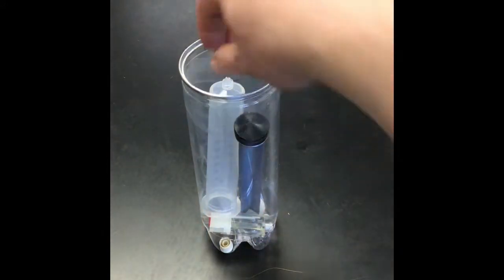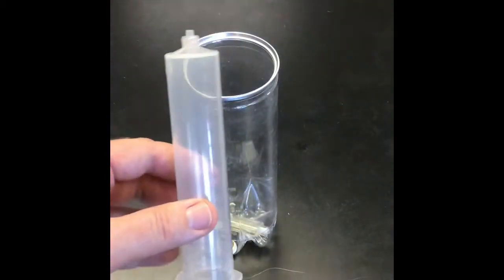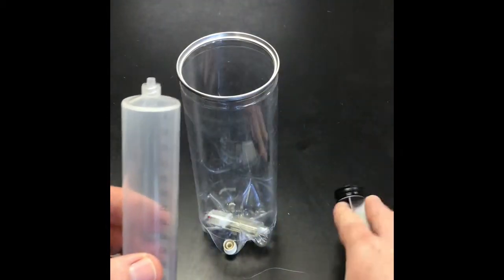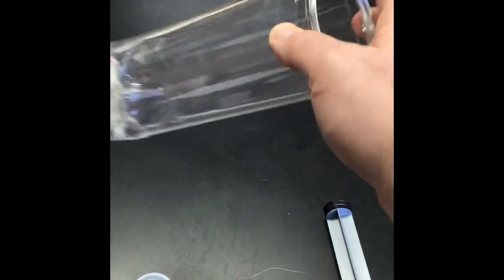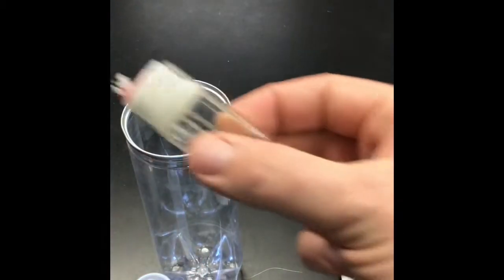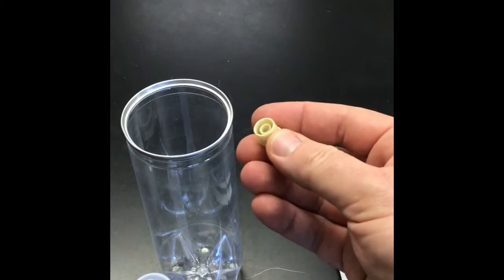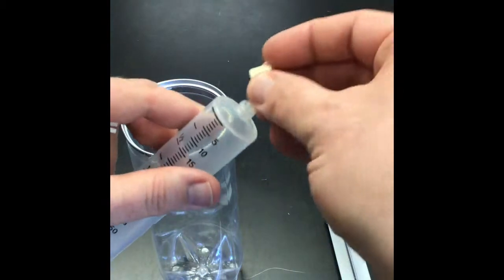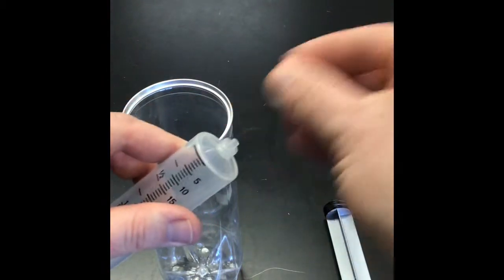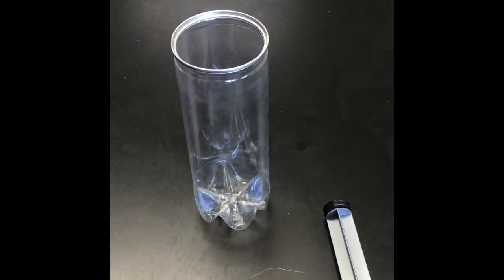You also have a 60 milliliter syringe. The syringe barrel and the plunger may be separate. You don't really need the plunger, so you can just set that off to the side. But you will need the barrel, and you're also going to have in there the butane source, okay? And then you're also going to have a tip cap for the end of the syringe. That's going to end up being like that, but you don't want that on there just now. And then you've got the tennis ball canister itself. That's going to be our reservoir of water.